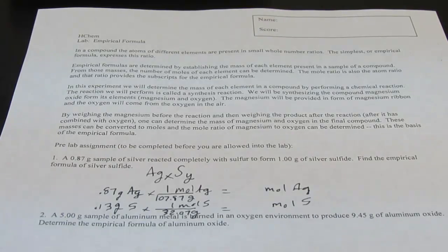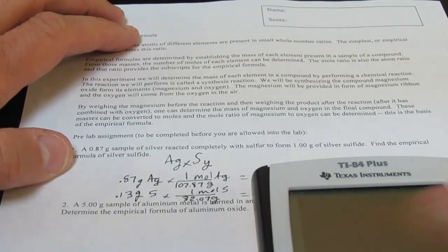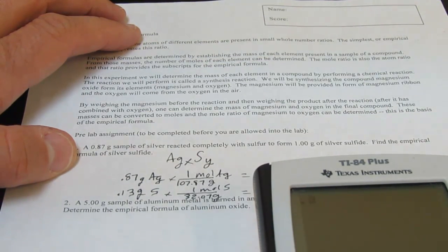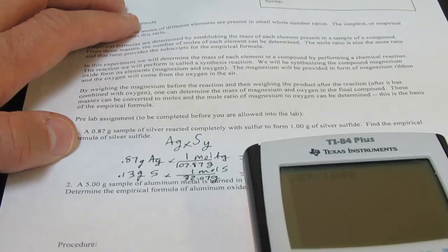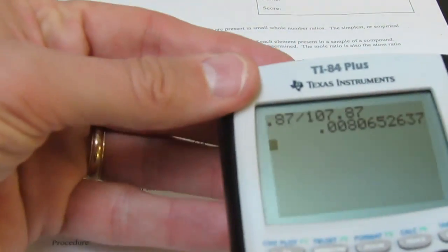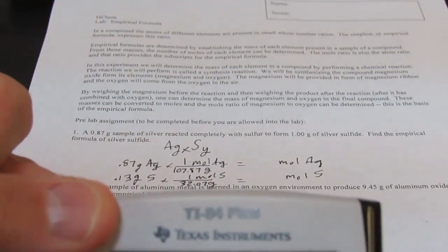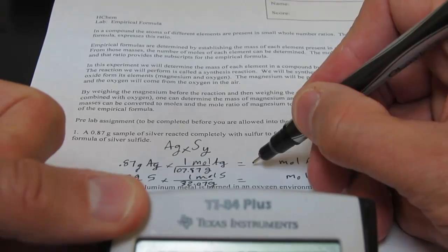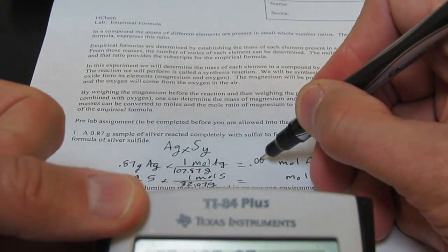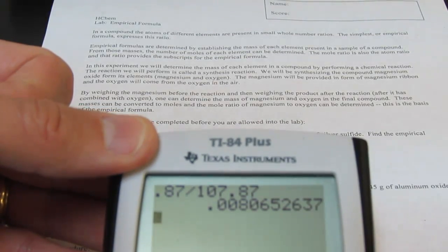Let's pull out our calculators here and we'll plug and chug a little bit. 0.87 divided by 107.87 shows that I used 0.00807. Looks like we're only allowed two sig figs, so we're going to call that 0.0081 moles of silver in this compound.